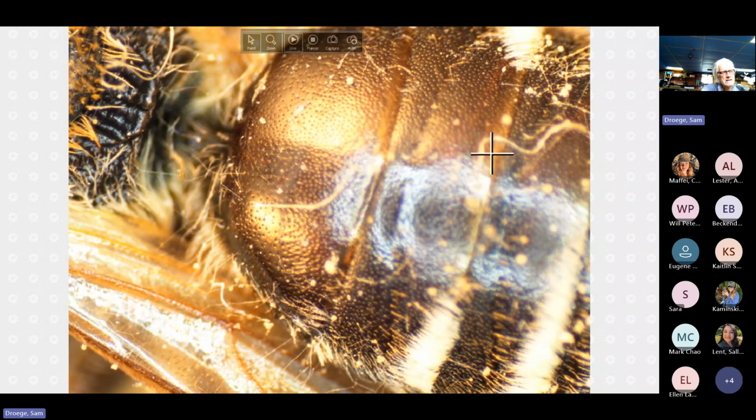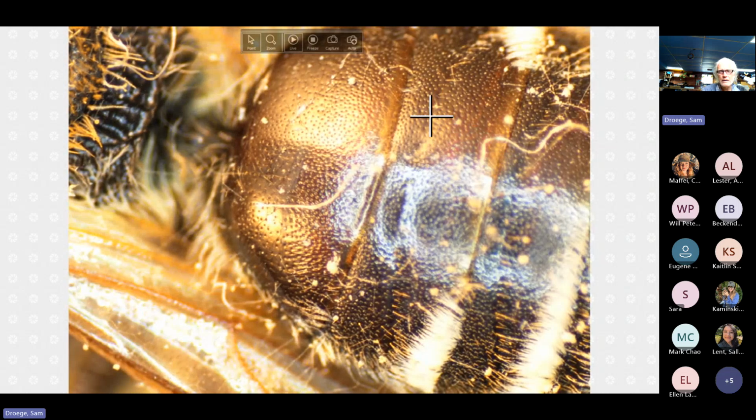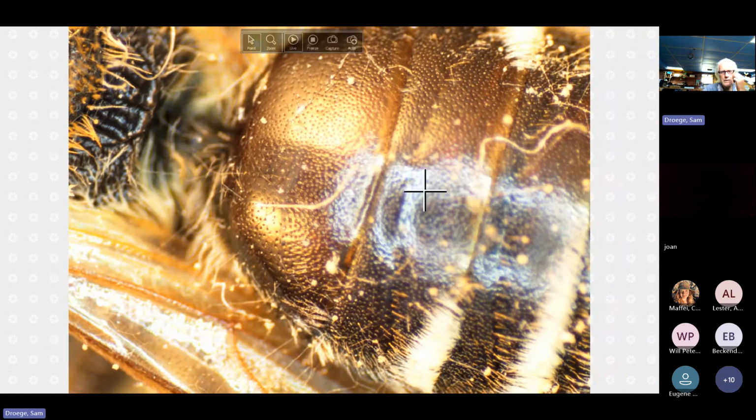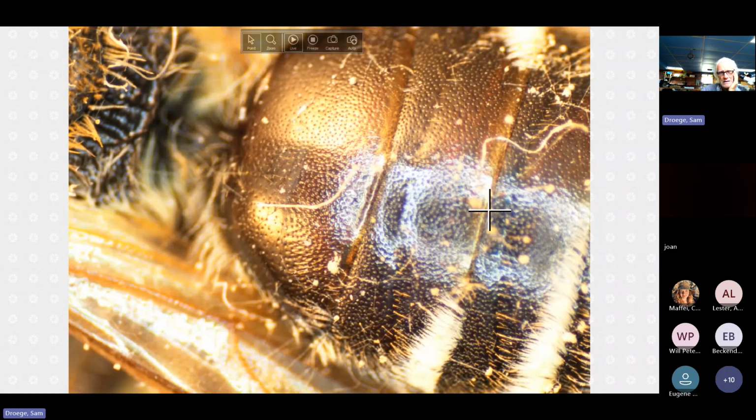And then if we look at T2, which wasn't one of the features, but I do want to point this out as useful many times, you can see the depressed area, so the depressed part of the rim goes way the heck up there. And you can see that if we're measuring these relative distances, we might say 80%, maybe even a little bit more of the total length of this rim is in the depressed state.